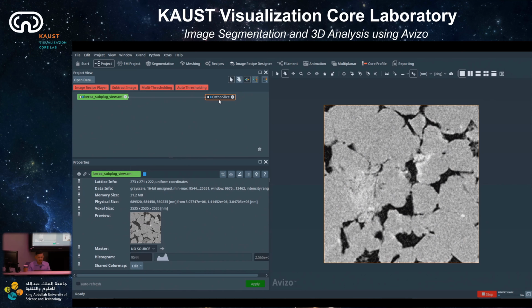So now, the way to attach a module to this dataset is to click on the data first and then right click on it. Once you right click on this data, unfortunately you don't see the drop down menu. I try to see if we have them here.